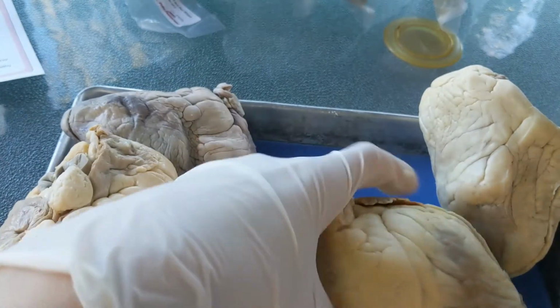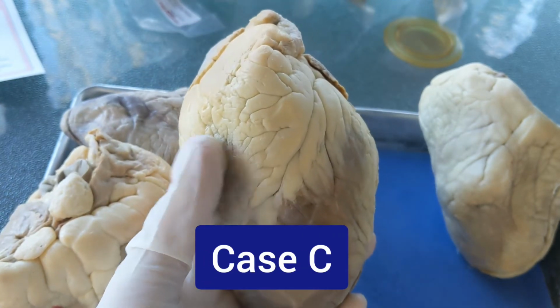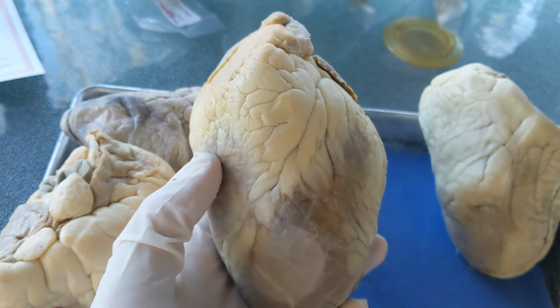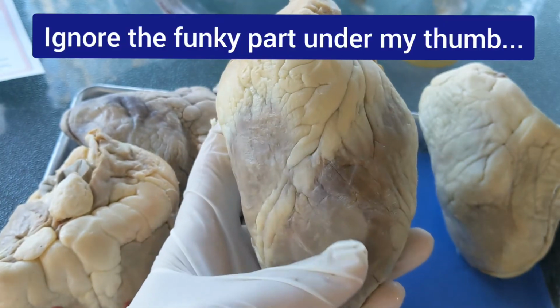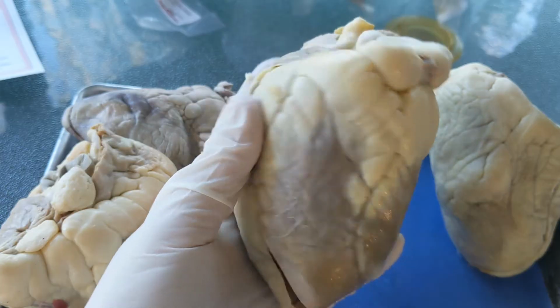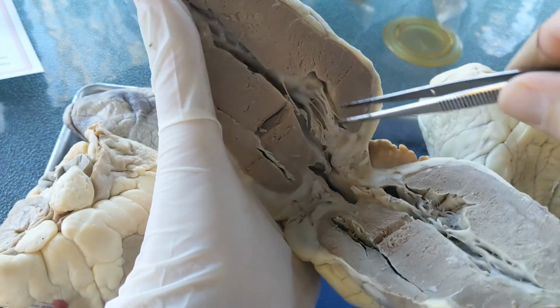Okay, now we are on cardiac case C. Oh, this one's sad. She was only 27 years old. Not that it's not sad if you die when you're older, but recently married, and her skin often had a blue tinge. So now we're looking at her heart externally. Really check out the coronary arteries. And then we're going to do an internal examination. So the hearts have already been bisected. Look at each valve.